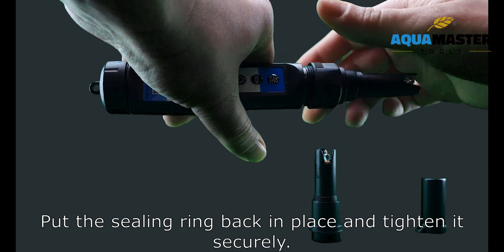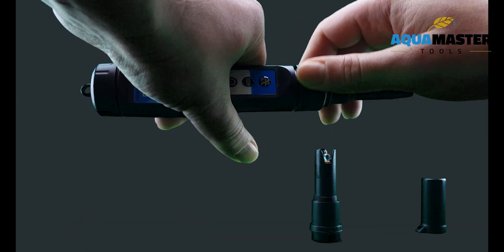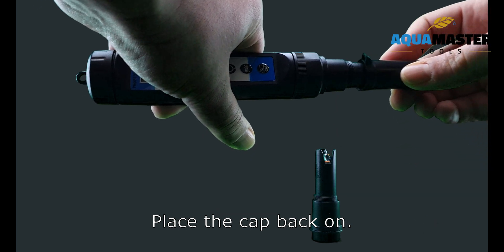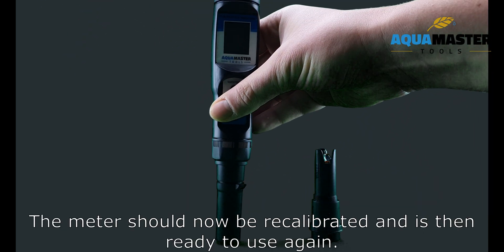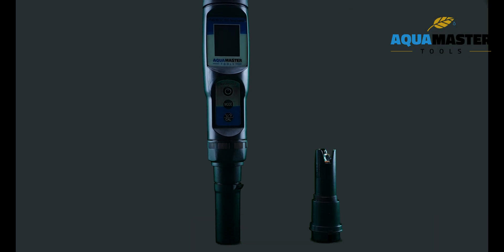Put the sealing ring back in place and tighten it securely. Place the cap back on. The meter should now be recalibrated and is then ready to use again.